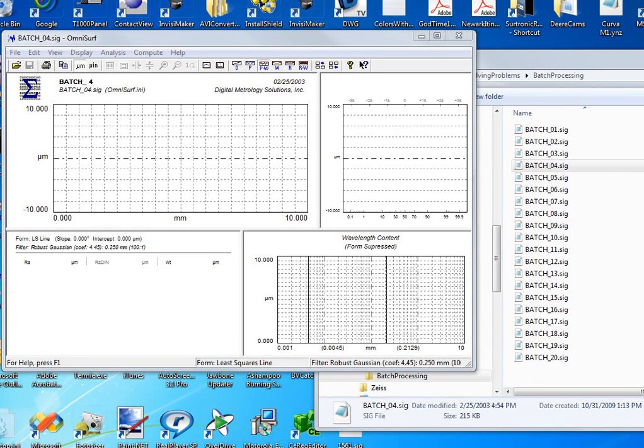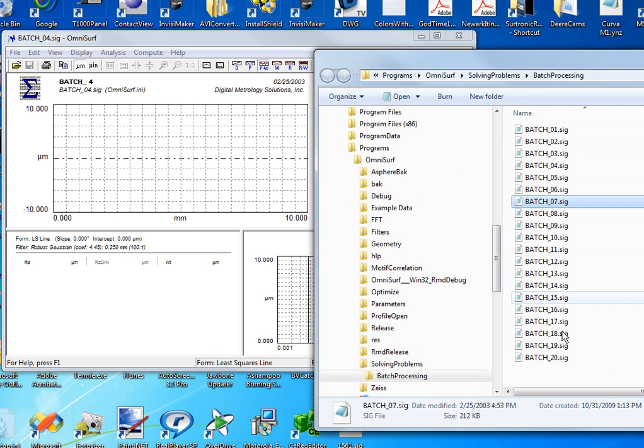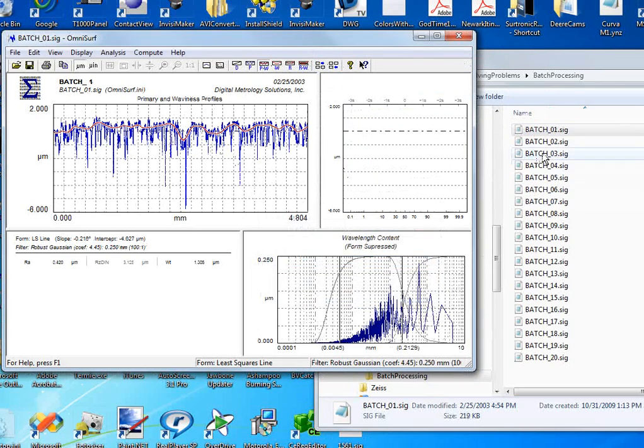Hi, this is Mark Malberg with Digital Metrology. Quite often I'm given lots of data files to process with OmniSurf. In fact, here's a batch of 20 data files, and my typical approach is to drag and drop them into OmniSurf.